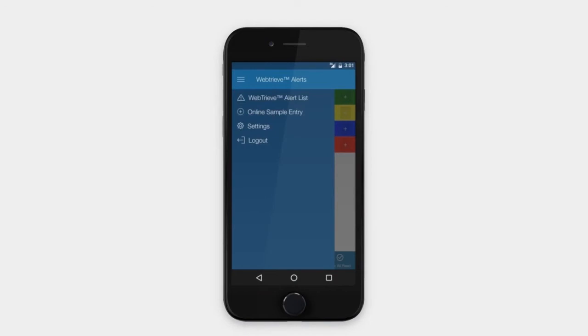After logging into the app, you can review your sample alerts, submit samples to the laboratory, or adjust your user settings.